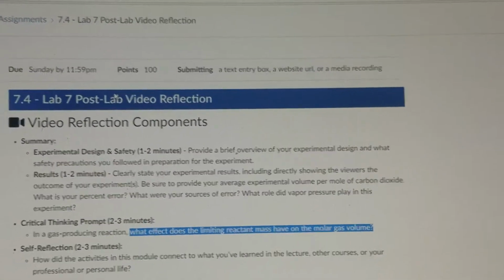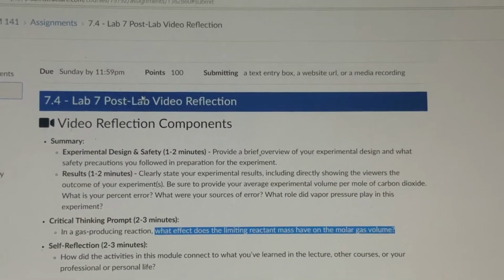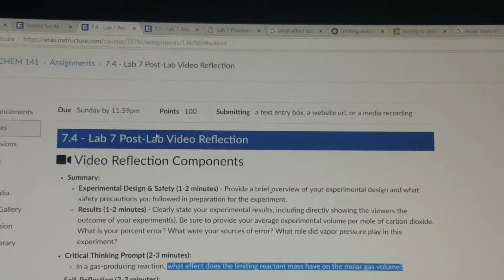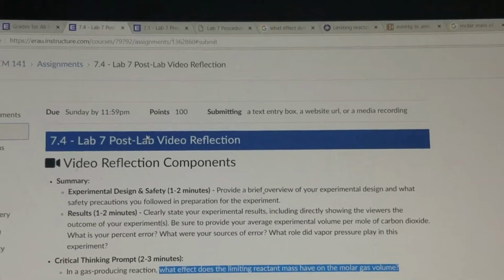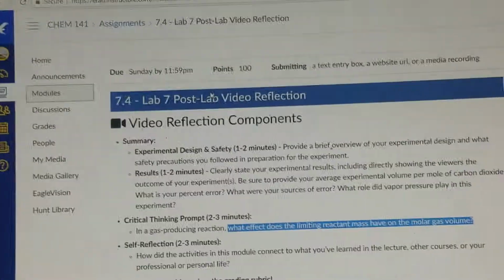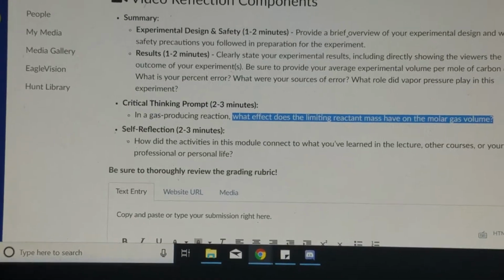Two flasks with two rubber stoppers, one with one hole and one with two holes. The one with one hole will have a 3-inch rigid tube, and the other one will have a 3-inch and a 6-inch tube. The 6-inch rigid tube has to be submerged in distilled water, and these are connected using pipes, and those pipes will collect the water into the graduated cylinder.